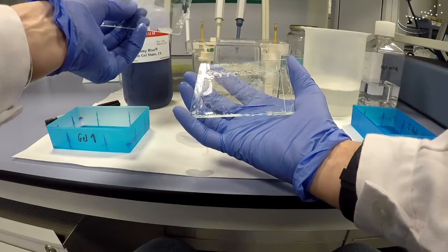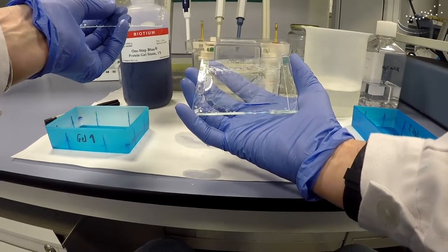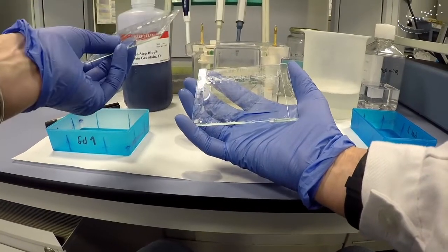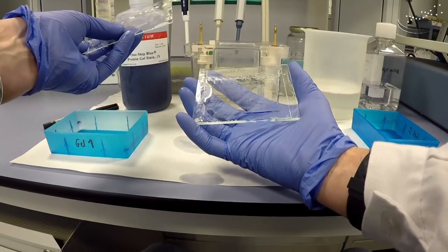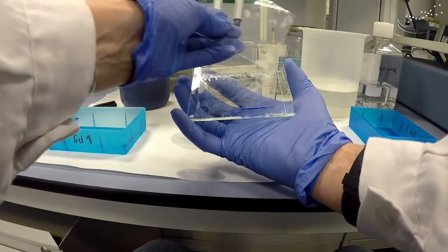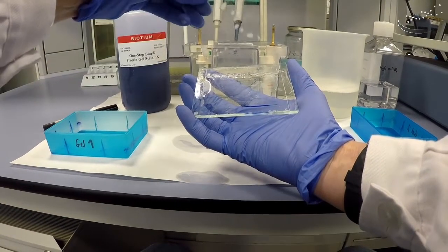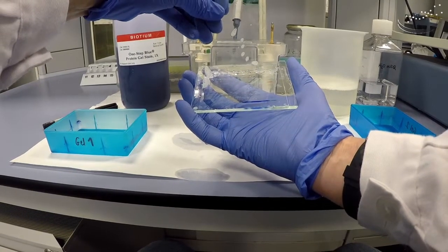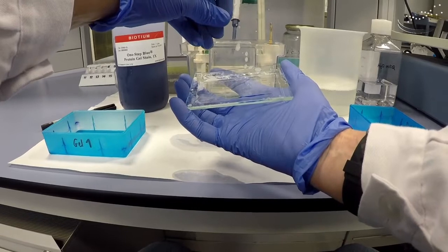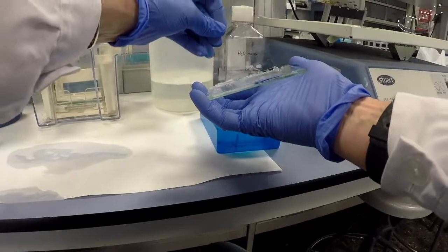Normally we remove the stacking gel because it's very sticky and can break and pull on the rest of the gel. So we just use the short plate, turn it sideways the thin way, and press down to cut off the stacking gel. You'll be able to see the border between the stacking gel and the resolving gel. Just take the glass plate, push down, and literally cut off the stacking gel, then use the glass plate to push it off and discard it.